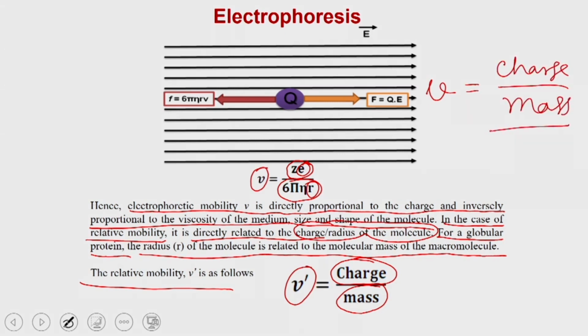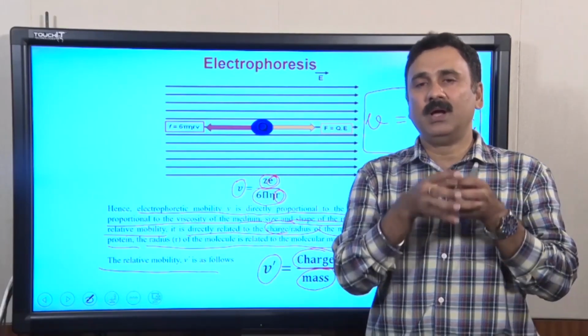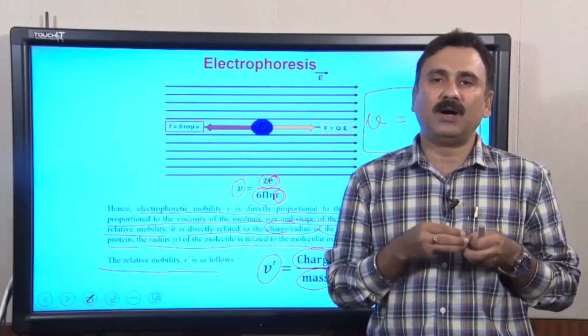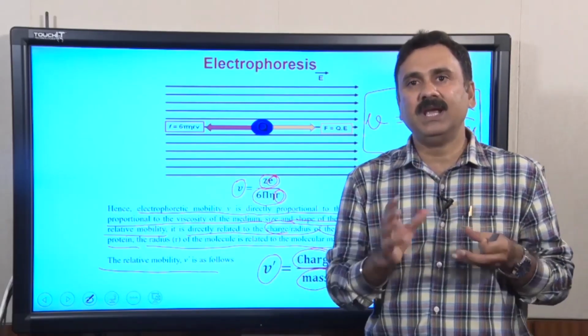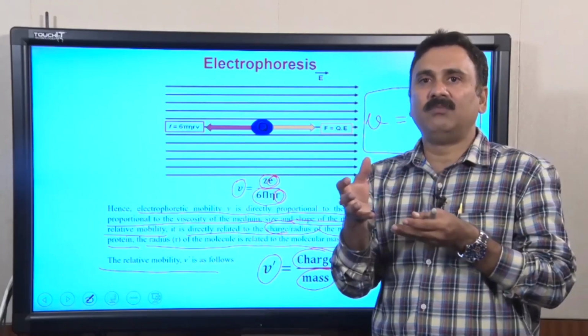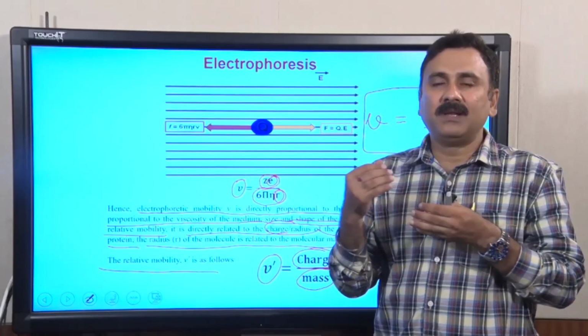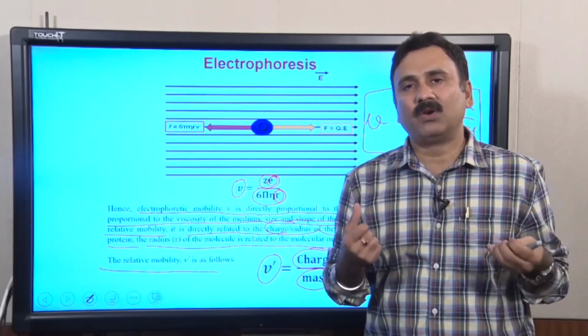That is the basic principle of electrophoresis. If you are running a substance in the electric field, the electric forces are going to be opposed by the frictional forces, because you are running the sample through a matrix or gel-like substance, and this viscous material is going to oppose the movement of the molecule.